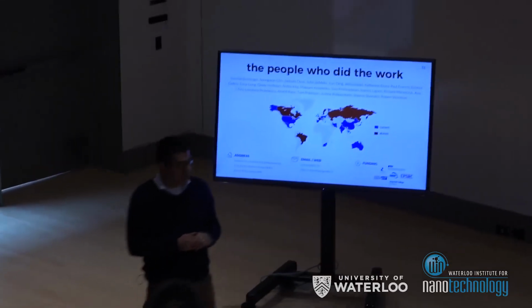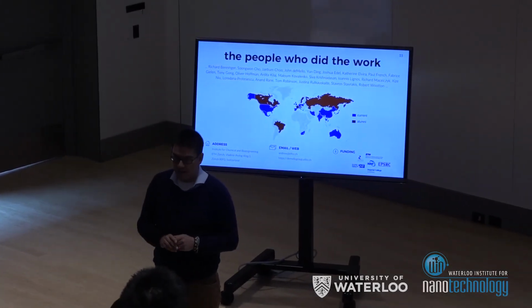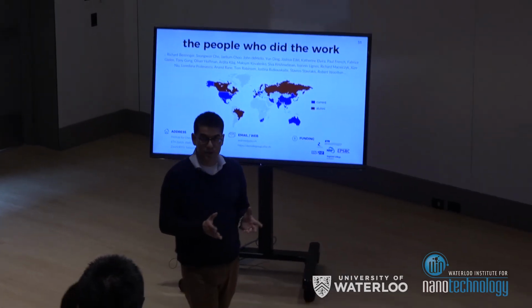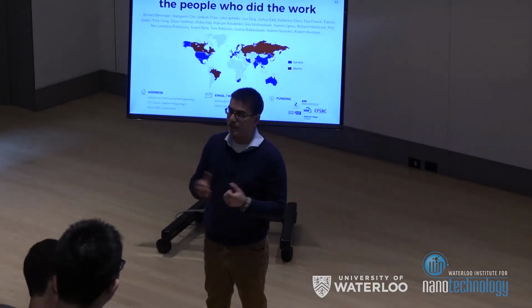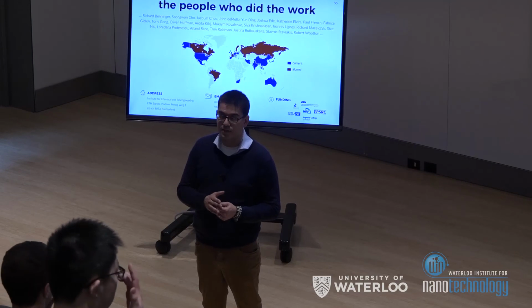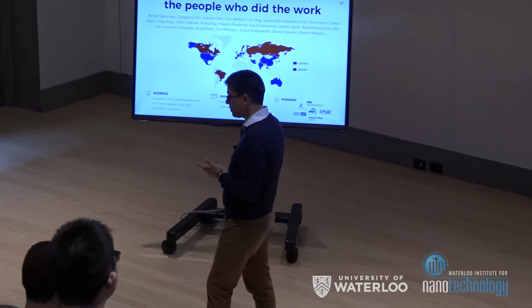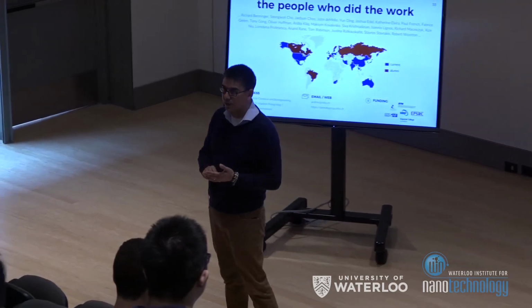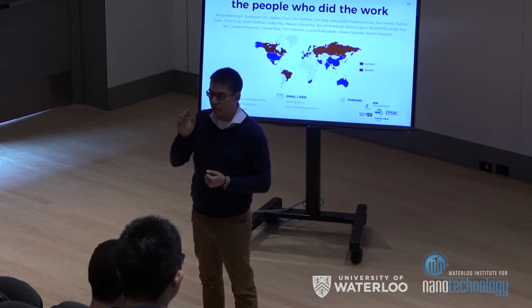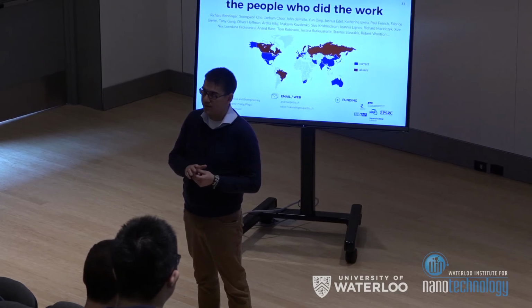So Raman is a technique, as you well know, Chris, which is analytically very desirable because it's incredibly information-rich in terms of the information you can extract from it. The key problem in these systems is obviously the accessible limits of detection. So we work with both surface-enhanced Raman and surface-enhanced resonance Raman for particular applications. If I could have my way, SERS would be the best way for us to do many of our experiments.